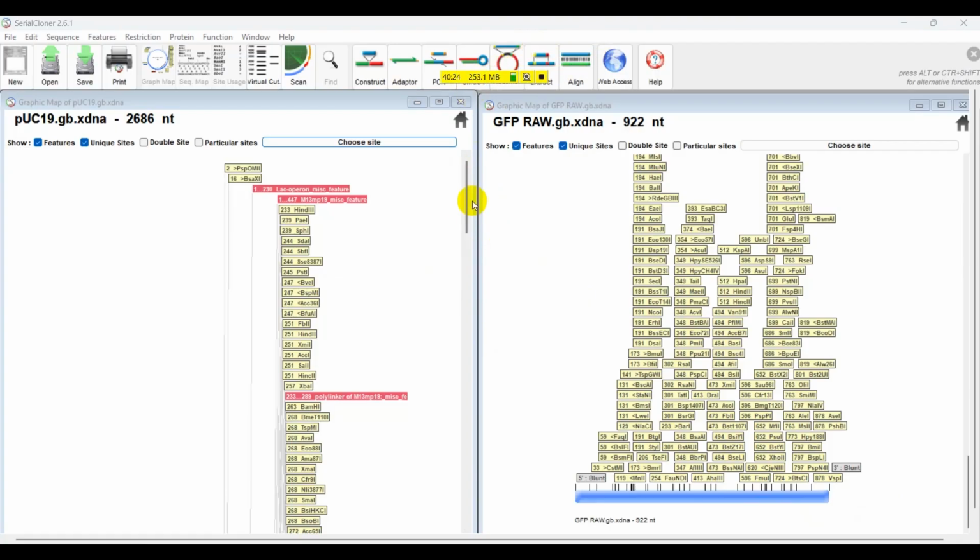So we need to create a new restriction enzyme site in this GFP, because for inserting this gene in pUC19 we need the same cutting site which is common with the MCS, but the main disturbing part is that this GFP does not contain the same cutting site as pUC19. For that we need to deliver externally two restriction enzyme sites in the side area of the GFP raw sequence. For this we need to do PCR.